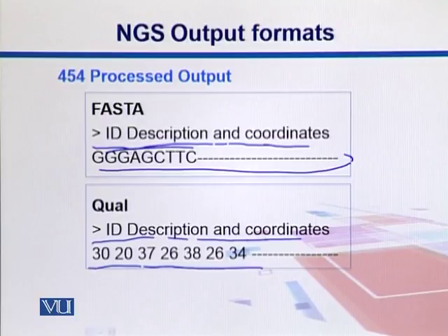So how good are these base calls? What base call means is looking into the flowgram and then identifying what base is there. So that has been related with some scores. We'll talk about that in a later section. So here is that quality score down there.